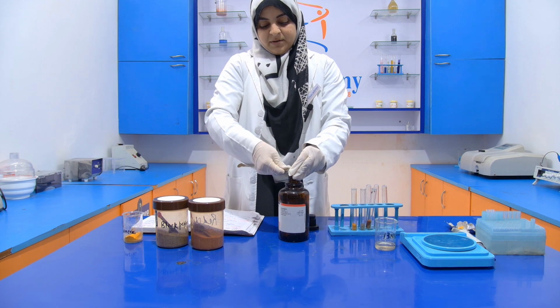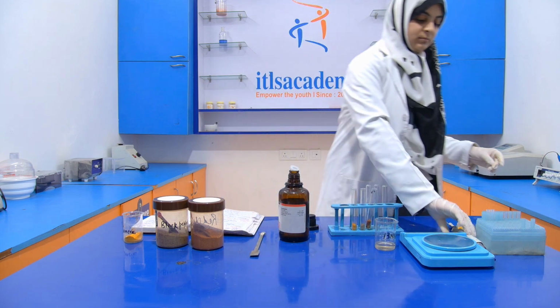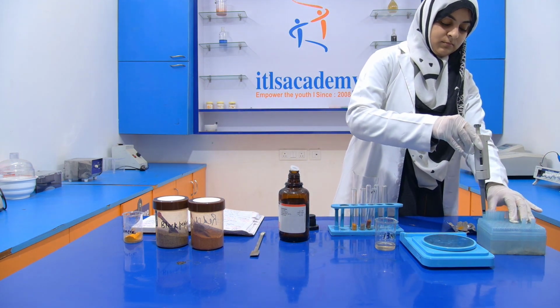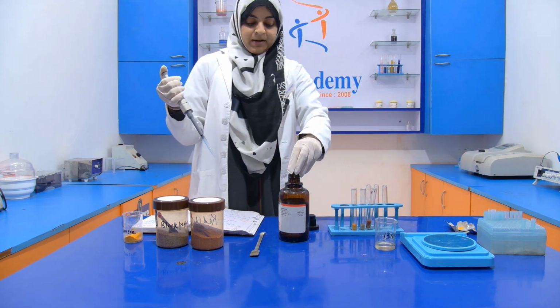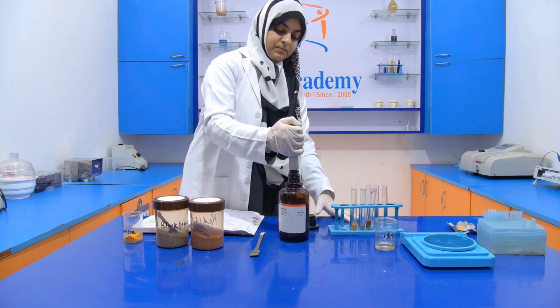Open it very carefully. Now add 3 ml into each test tube.